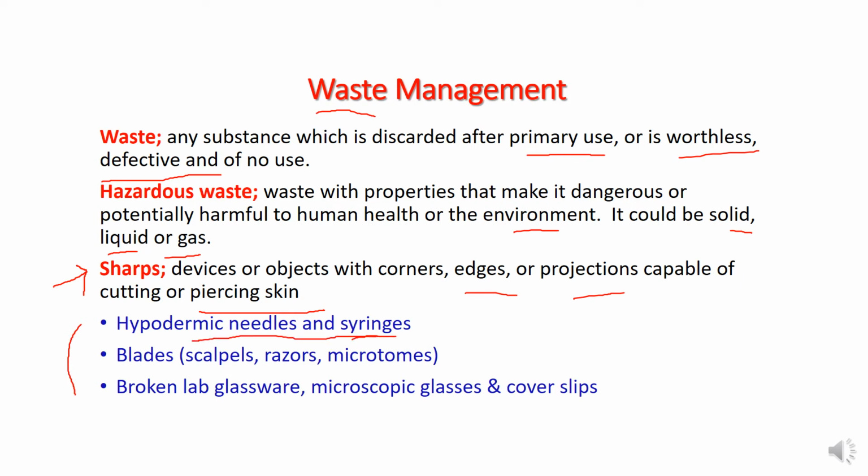Those are very commonly used as sharps. And blades, of course, used in nursing or to tear off skin, or for example to remove branches or leaves in agriculture, as well as in animal and human sciences. The blade is very common, and it's used for certain microtomes.